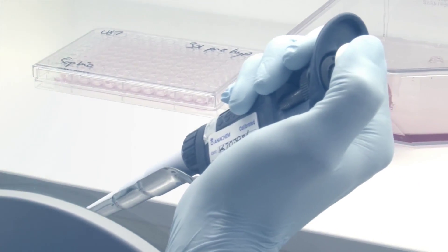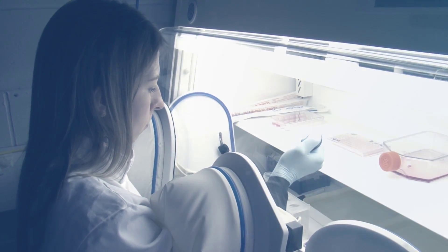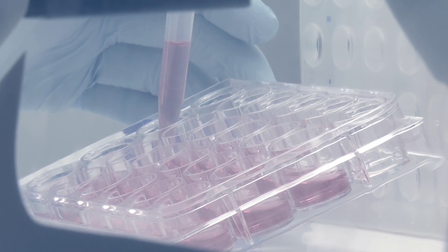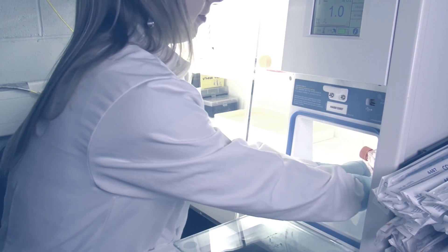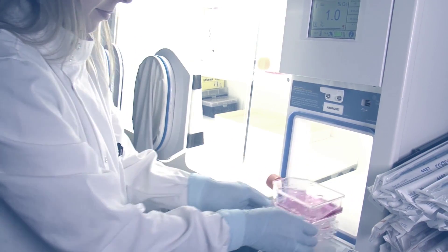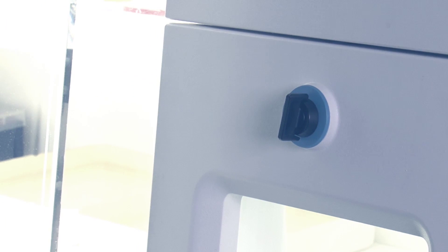Prolonged incubation of cell cultures in a controlled atmosphere workstation may require significant movement of materials in and out of the chamber and regular manipulation of cell cultures themselves. These operations can introduce a risk of contamination into the atmosphere and this can cause a loss of the cells.